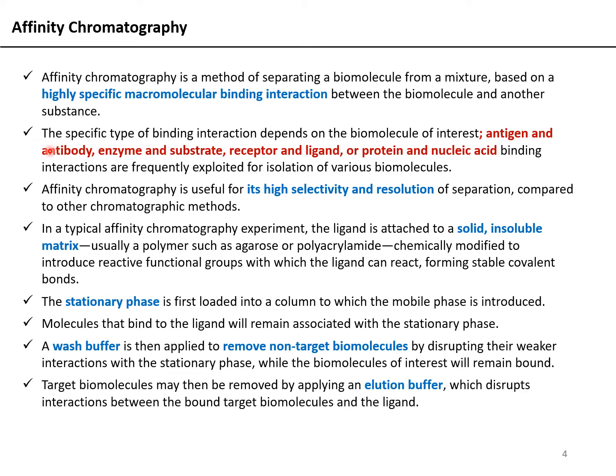beads. Now in order to elute these flag tag proteins out of the beads, you're simply going to add an excess of flag peptide. Now this flag peptide will compete out the biomolecule or the protein with the flag tag that is bound to the antibody, and it will compete out this protein to bind to the antibody, and now you will have your protein in the elution. It might seem a bit confusing, but think about it, it will get clearer. So the target molecule is thus recovered in the eluting solution.